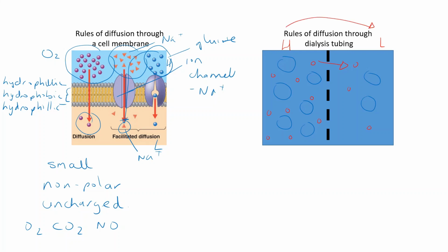However, the large molecules will not be able to pass through because it's physics. They simply cannot fit through the little holes. So bear all that in mind, and coming up next is me in the lab doing the experiments.